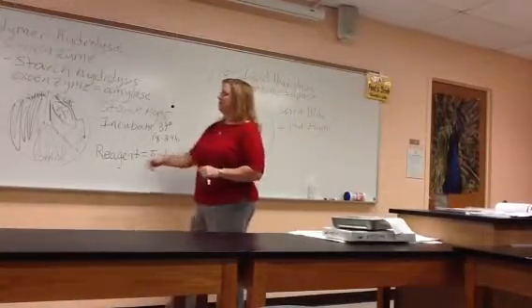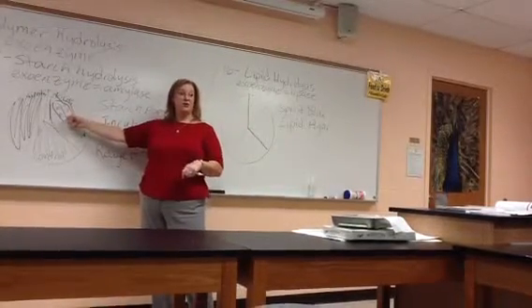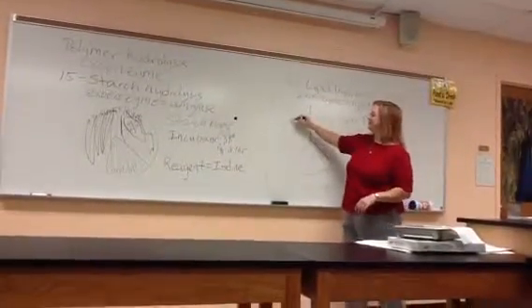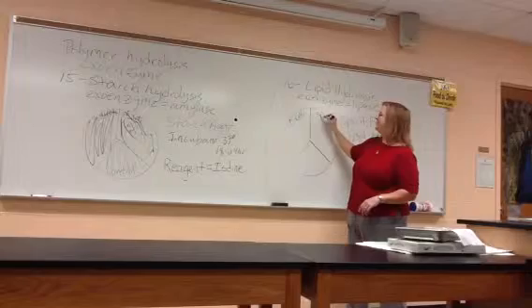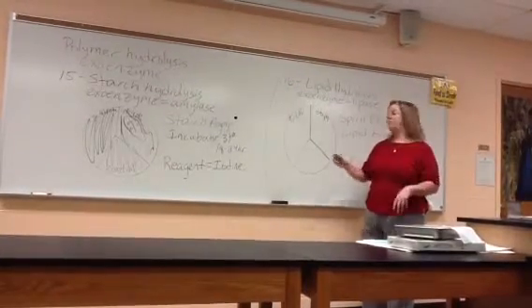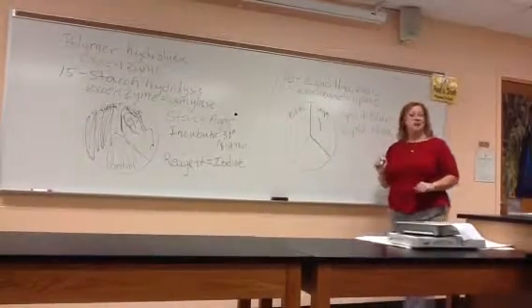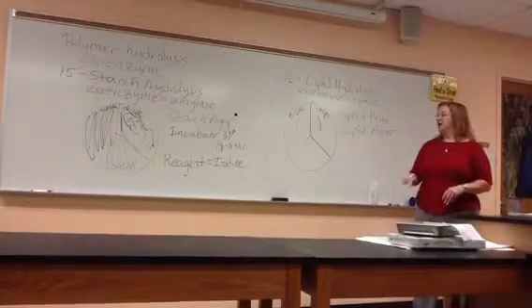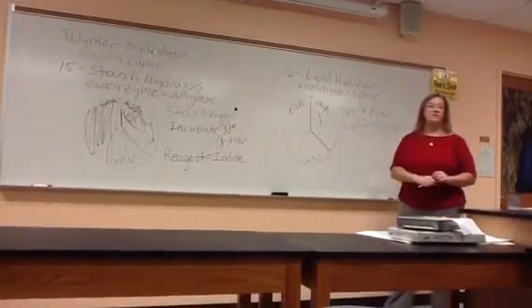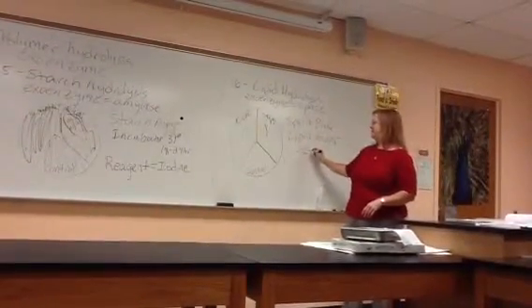So what that means is when you apply E. coli to this plate, don't scrape up every bit of E. coli in that tube and put it on this plate, right? Save some for this plate. Okay, so you label them, E. coli, staph, and you're doing the same thing, aseptic technique, flame your loop, the openings of the tubes. You're just drawing one straight line of E. coli, one straight line of staph, short lines, and then you have one control section that has no bacteria in it. And it goes in the incubator, same time and temperature.